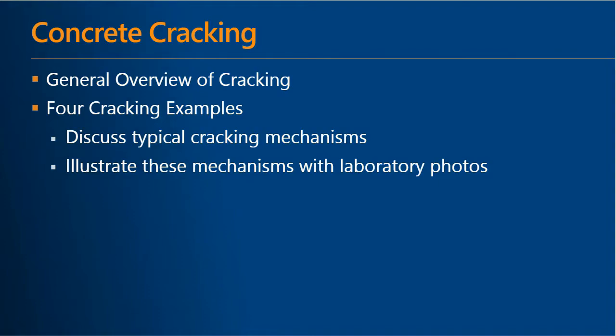Thanks, Daniela. So now that you all have a better understanding of how exactly we perform our examination in the petrographic laboratory and what tools we use, we'll now start talking about cracking in concrete. And so we'll provide a general overview of cracking, and then Daniela and I will be presenting four examples of cracks that you may see in the field, and then the typical cracking mechanisms or causes that could be resulting in those crack patterns. And then we'll show how we are able to discern those cracking causes from each other with our laboratory examination and specifically laboratory photos.